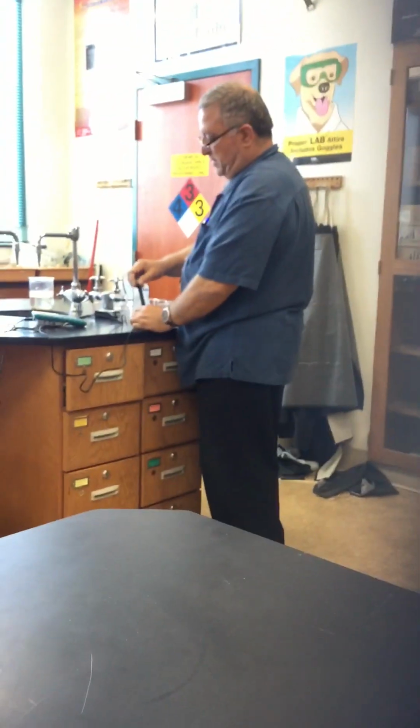So we're gonna take the electrode out, and we will dump the distilled water and take some tap water into the beaker. This is different.